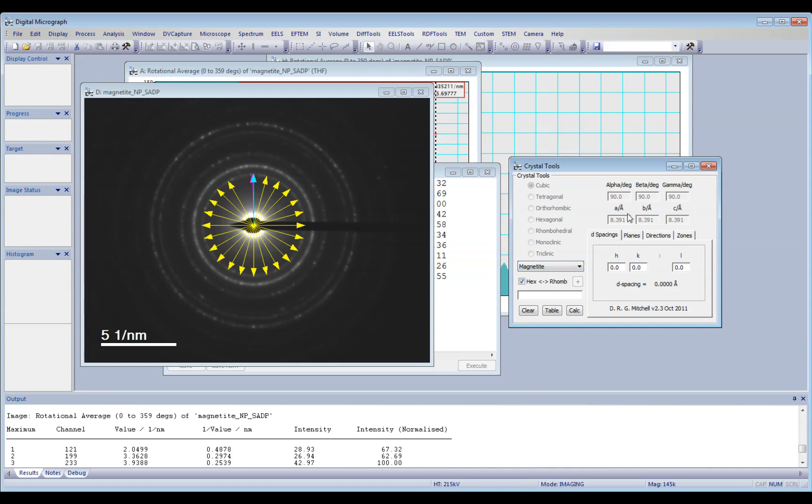But if you haven't got the material you are interested in your list, you can also check here if it's cubic, tetragonal, orthorhombic, hexagonal, and so on, and you type the lattice parameters here.